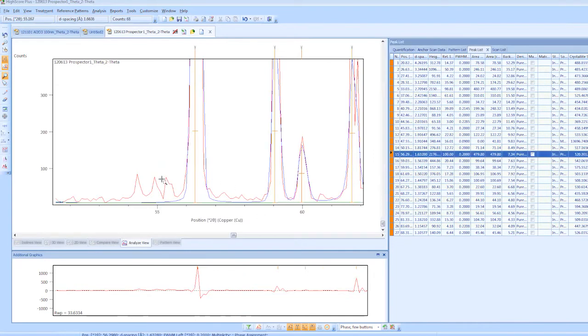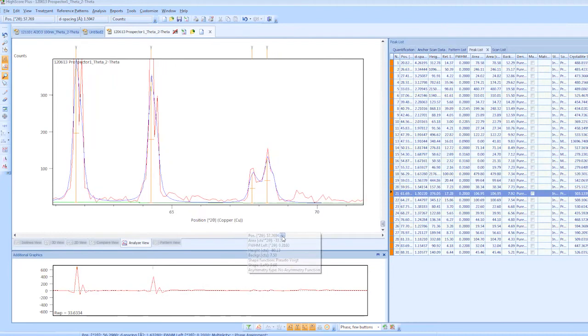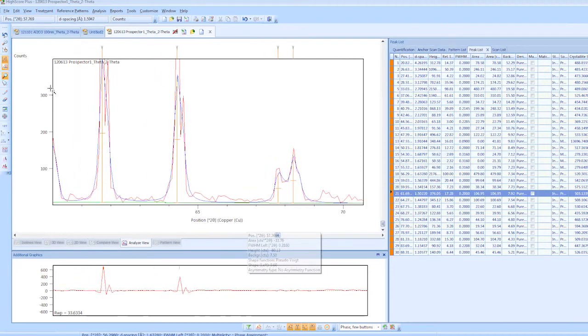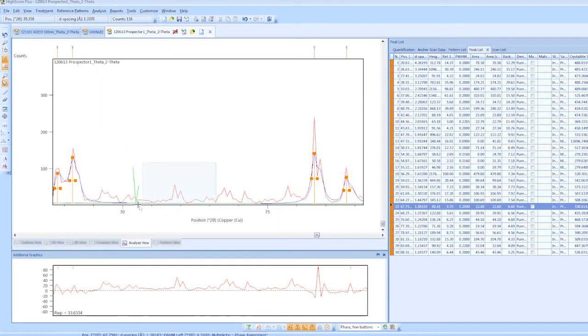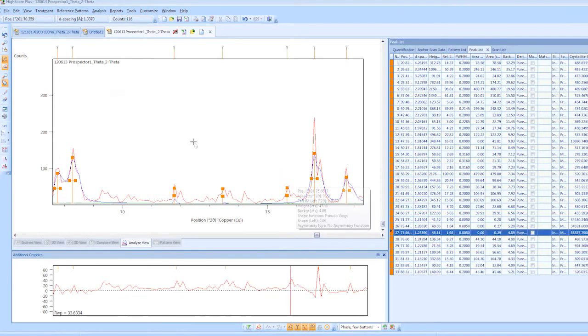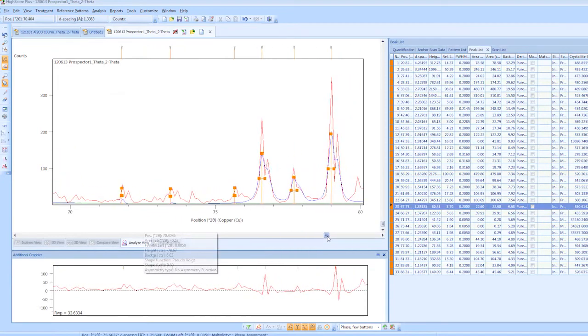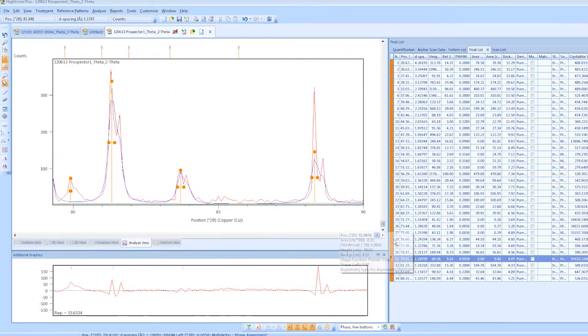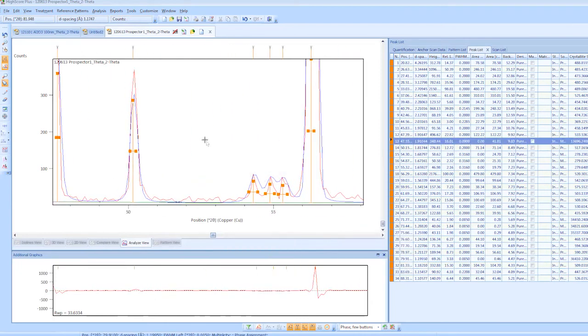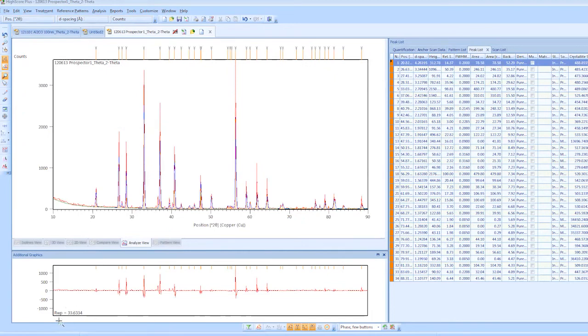Looks. There's probably a couple peaks there. All right. So let's see here. So there's a peak here. Yeah. I'll let that go there. There's a couple peaks here. And there's definitely one there. Okay. Okay, so we had a fitting of 33.6.